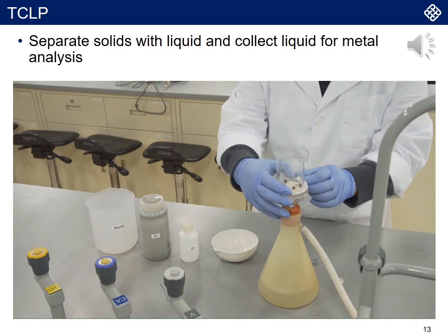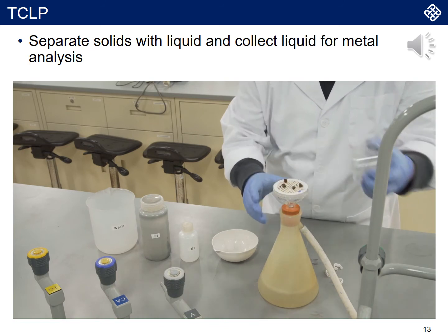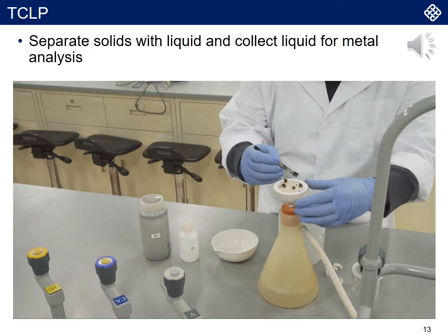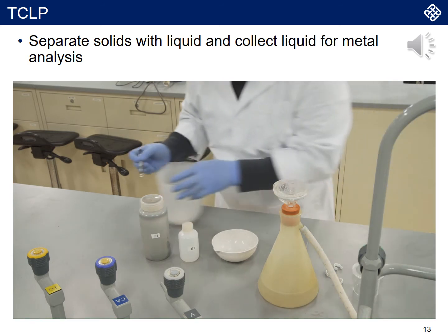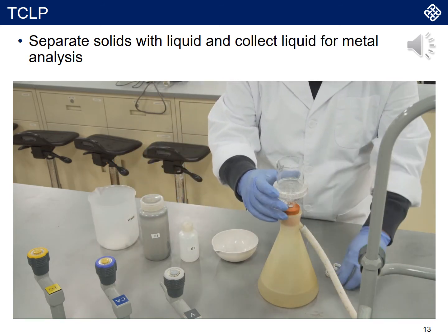And then the next big step is to take out the filter paper, and as demonstrated here, the solid part we just take away.